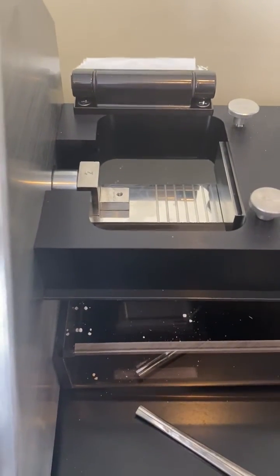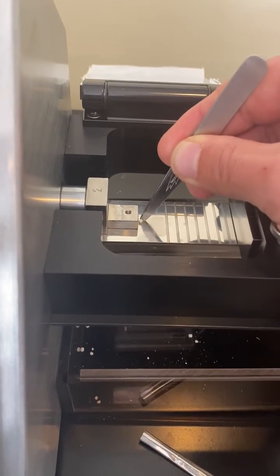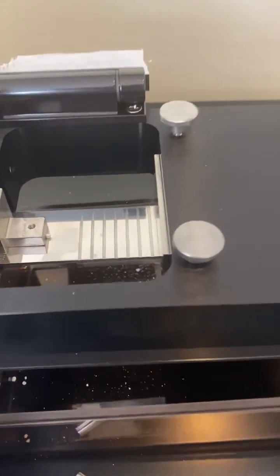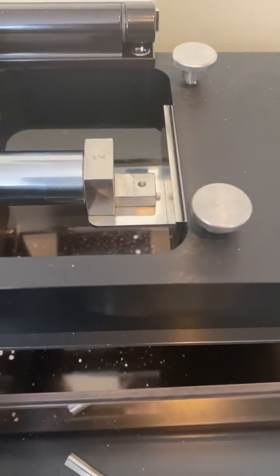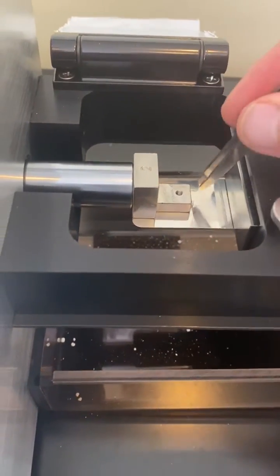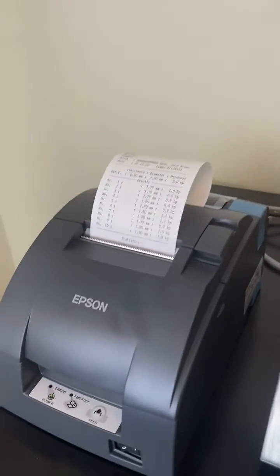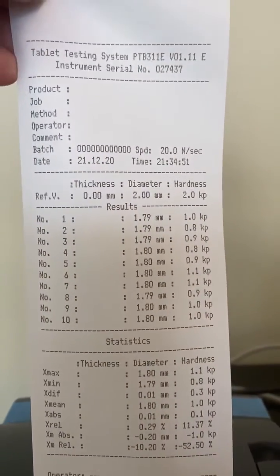Sweep away the broken tablet. So there's our 10 tablets. We press stop once and we'll get a printout. You can see that you get a time and a date stamp.